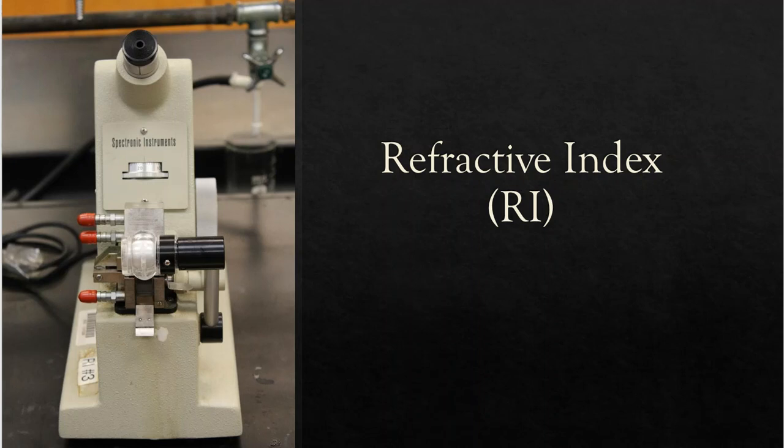Refractive index is also something that they should provide you in general chemistry, as it's one of the basics when you begin to talk about physical and chemical characteristics and properties. Refractive index is involved in that whole conversation. You should have used a refractive index in general chemistry, but there's a chance that you probably didn't. Depending on where you took it, who you had, and what equipment they had in the lab, there is a possibility that you have never seen refractive index before.